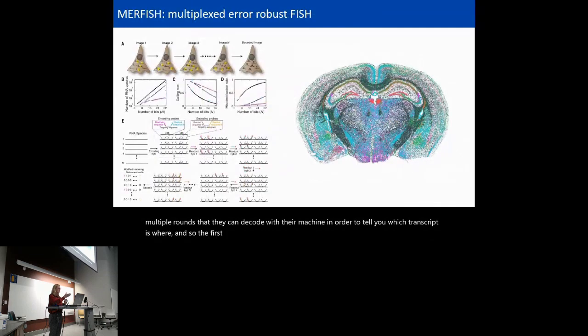And so the first one that came out was MERFISH. This was developed also at the Broad Institute.